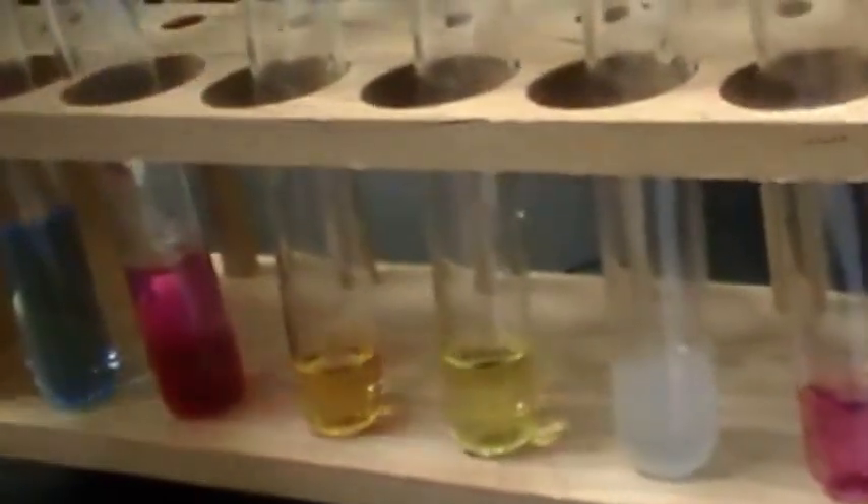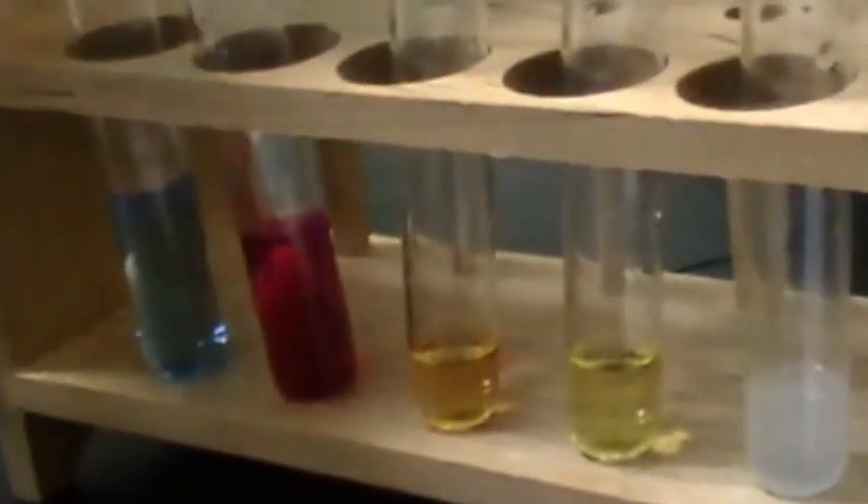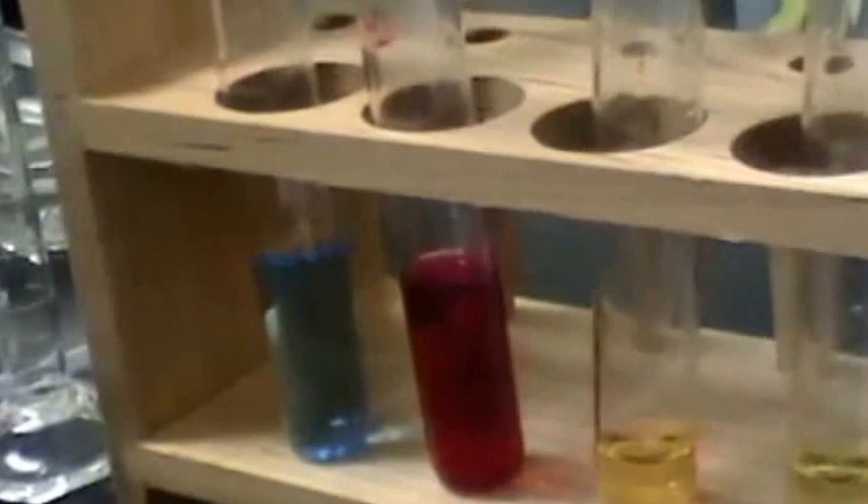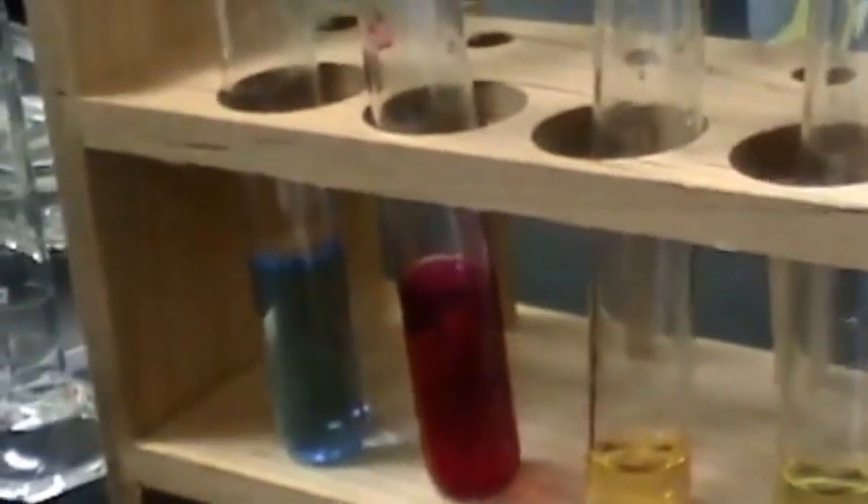So if I ever get a fish tank I want to put phenolphthalein in it. It got changed to a darker pink, I think — it just got darker. Anyway, this is 3.